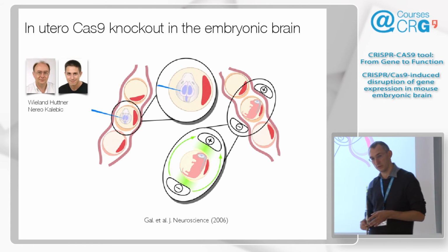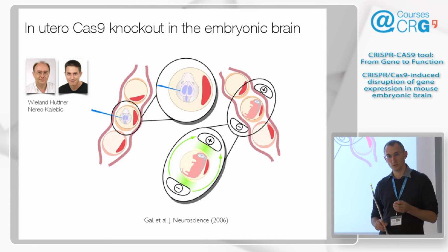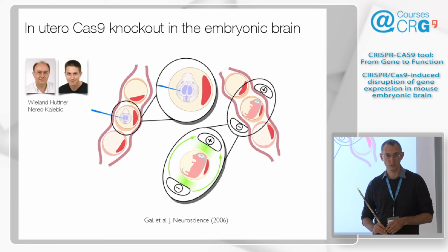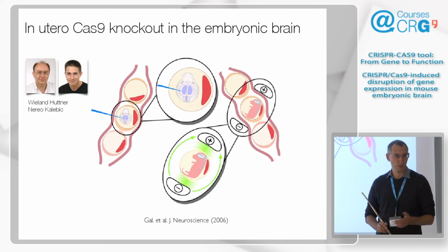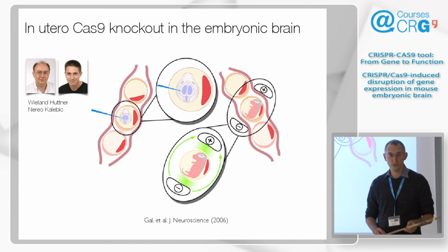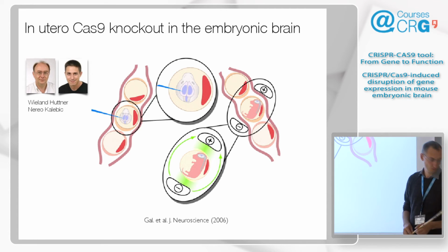It is a problem, having your template, and also if you're using plasmids for the Cas9 and the guide, that they will integrate non-homologously. It still happens, even though homologous recombination is very efficient. Many of your clones might be contaminated with non-homologous edits, and by Southern you will detect them, while PCR methods might not. If you have a mouse and you have an integration on another chromosome, it will be fine. You will outcross it. You're okay. In cell culture, this could be a serious problem. So yeah, it's a good idea.